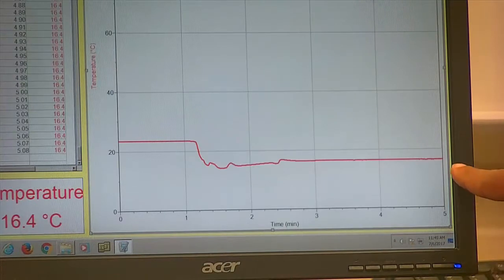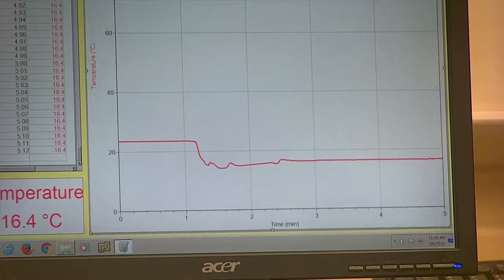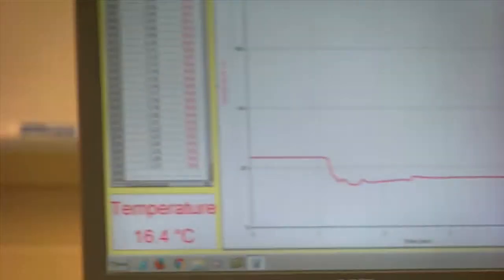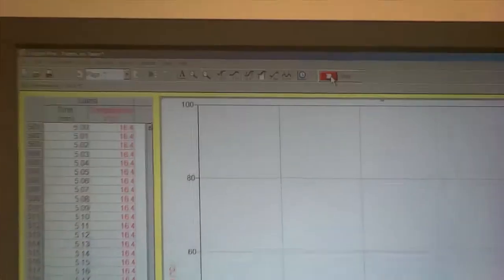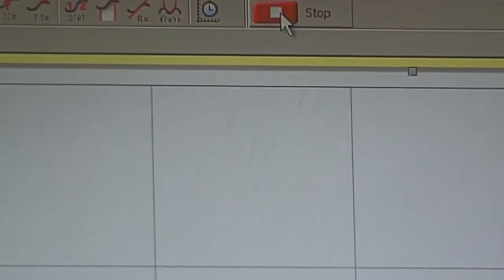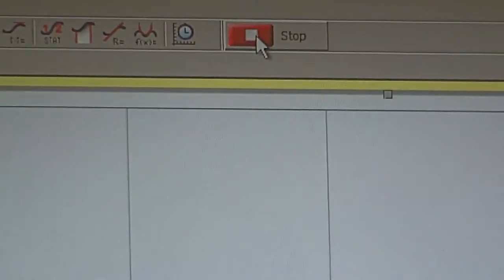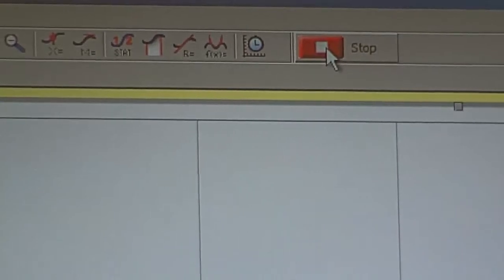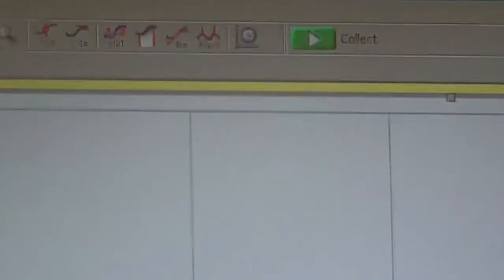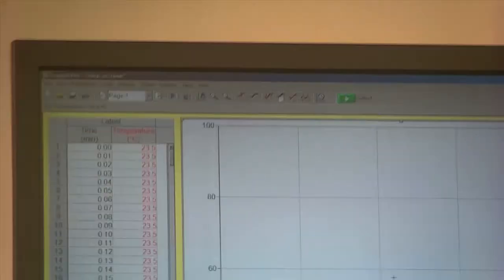We want to stop this after five minutes. Our data has reached the five-minute mark, and we are told we can collect just up to that time. So I'm going to click on stop. Anytime you click stop, that stops the data acquisition, so the experiment is done.